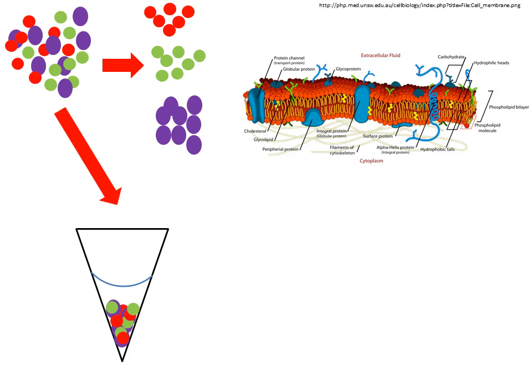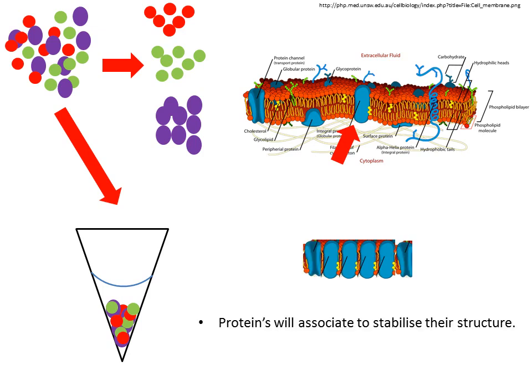Proteins that are embedded in cellular membranes are one such example, and if they can be removed from the membrane, the hydrophobic or water-hating regions in each molecule can associate together with each other and with similar regions from other protein molecules, whether they be a molecule of the same protein or whether they be a molecule of a completely different protein. The mass of molecules associating becomes larger and larger until it precipitates and falls out of solution.